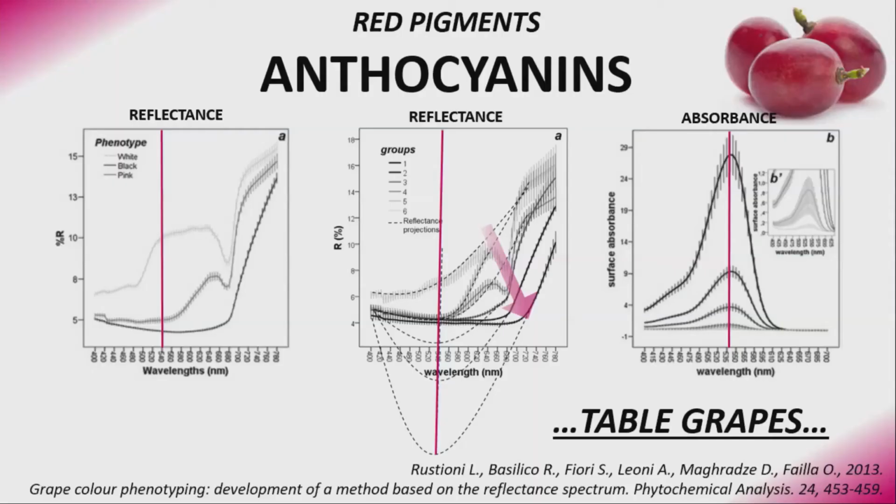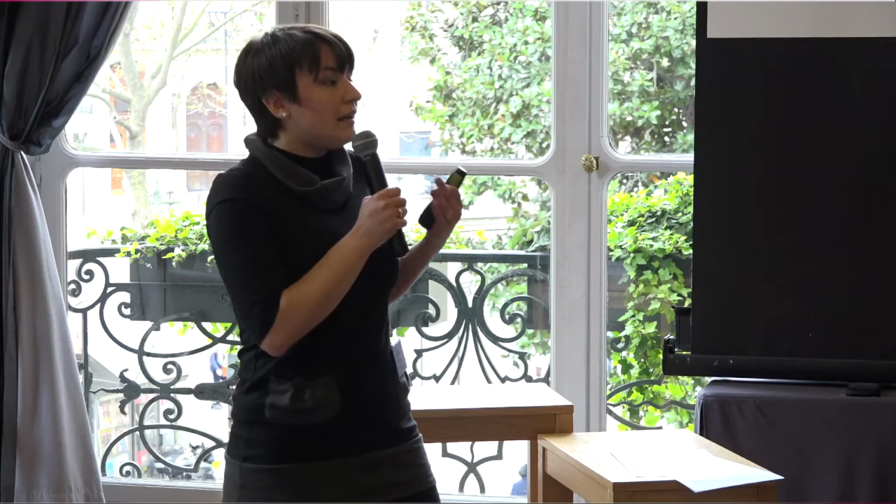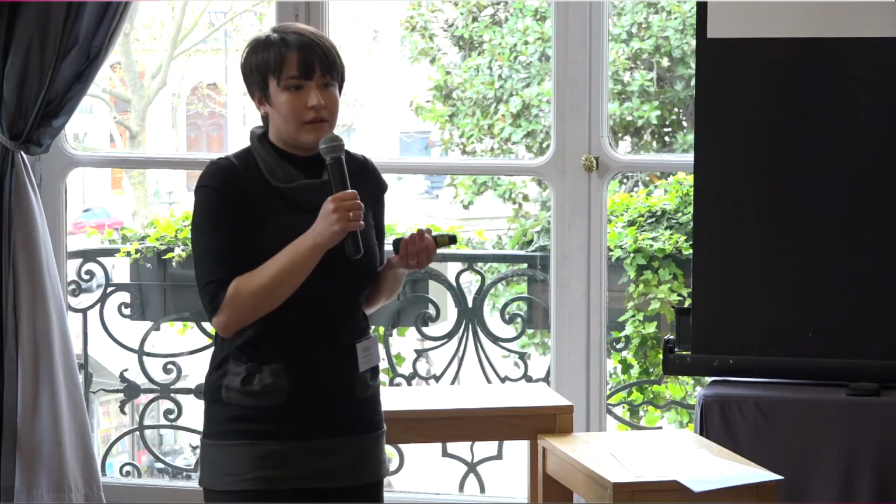So first of all, we studied anthocyanins. And we developed a method for the phenotyping of the color of berries, and also an index to estimate the color or the content of anthocyanins.